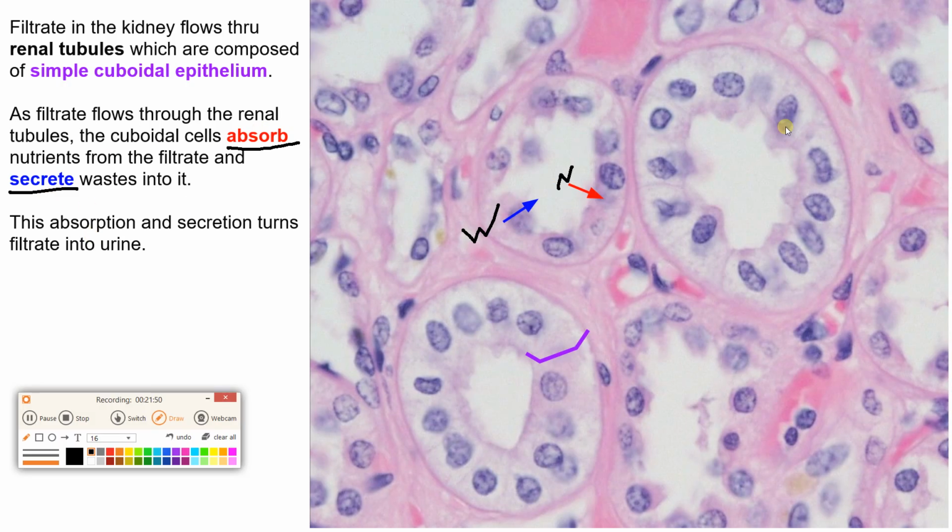All right, by the way, notice we have this pinkish line here. We mentioned that a little while ago. Do you remember what that was? That was called the basement membrane. So we see this basement membrane here. Okay, good stuff. Good job.